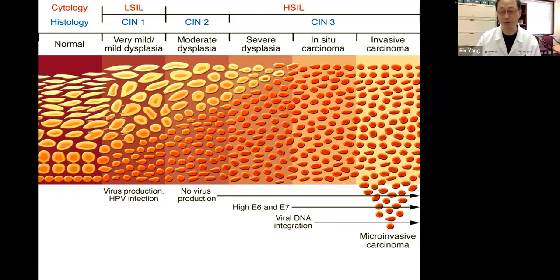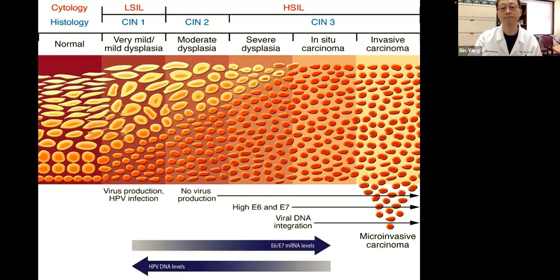Cytologically, we use the NC ratio. We'll talk about that in the cytology part.